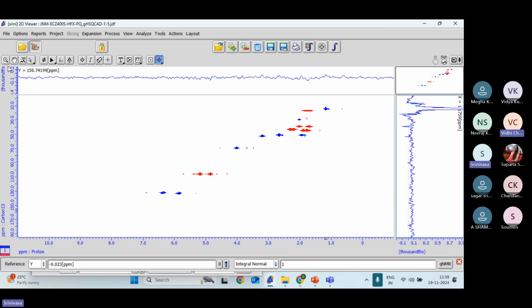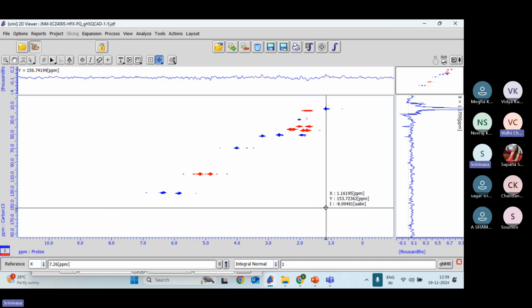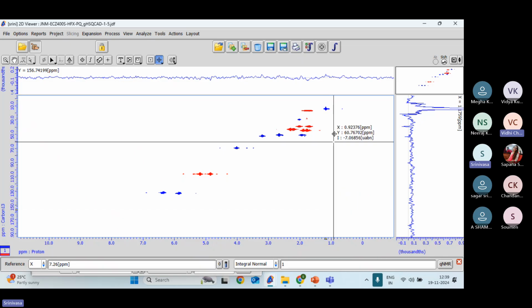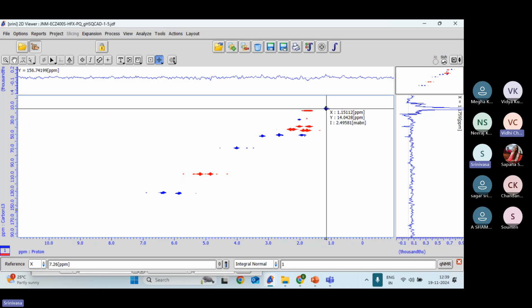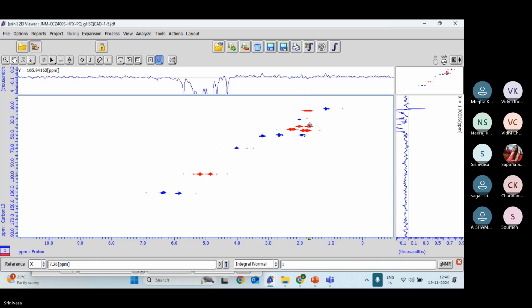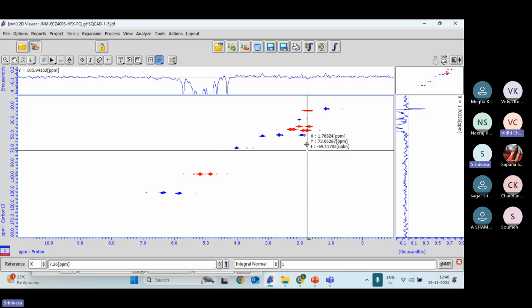Okay. So go to the context menu bar or the cursor tool, go to the last option. And then click on the middle, you can see the lines, right? Yeah. So the vertical line has to touch one of the peaks from the right side. Now you can see this line, this peak is contour stretching. It need not be the first peak. It may be a starting peak. If you consider this is my 0%, this is my 100%, then maybe you can take roughly around 20% area. Maybe I can take this peak here.